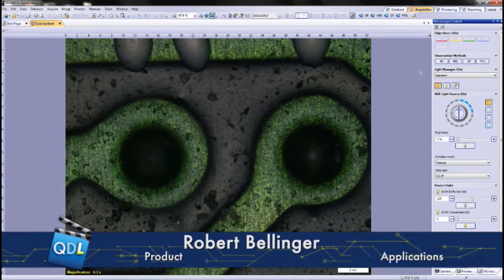It's an all-around tool for imaging techniques, bridging a gap across different samples — a workhorse microscope for a huge sample range. Coupling it with the digital camera system and the new Olympus Stream 2.1 software, it now interfaces with this microscope and reads in all those encoded features, whether you're in bright field or dark field imaging.